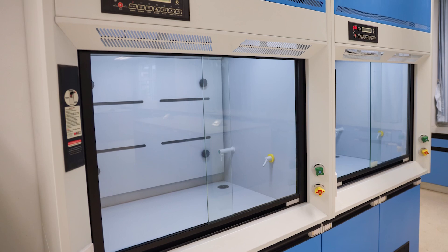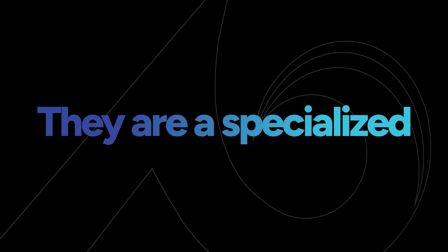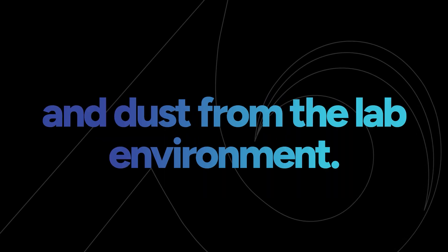Among these advancements, laboratory fume hoods have emerged as a critical solution. They are a specialized type of ventilation system designed to exhaust chemical fumes, vapors, gases, and dust from the lab environment.